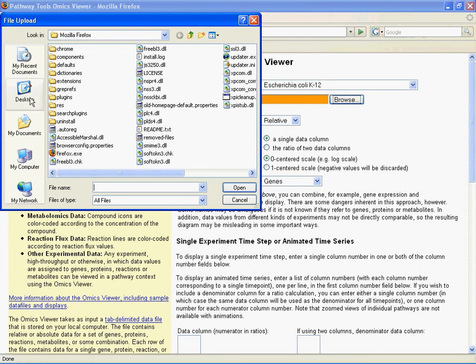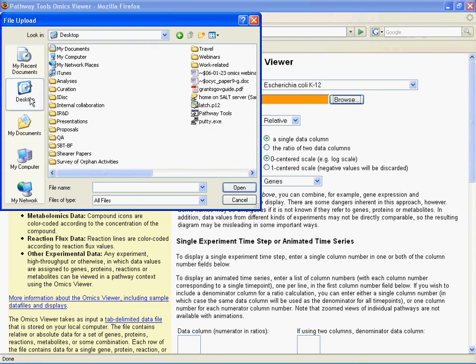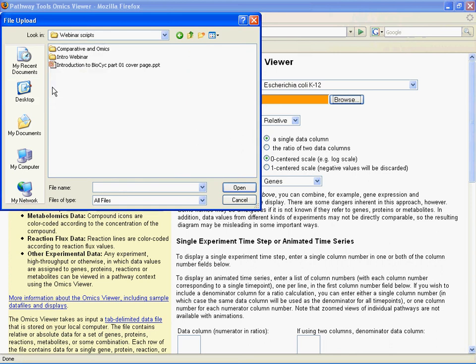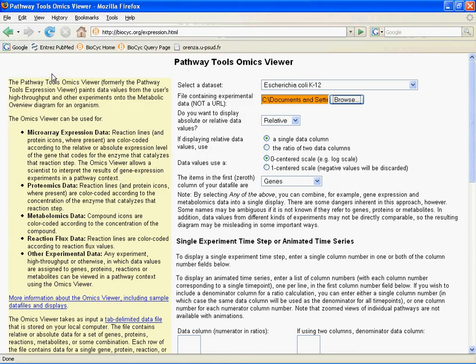I click on Browse, go to my desktop, and I have this stored under webinars, scripts, and comparative and omics. The one we're going to use first is example_omics.txt — that's the tab-delimited file I showed you at the beginning.